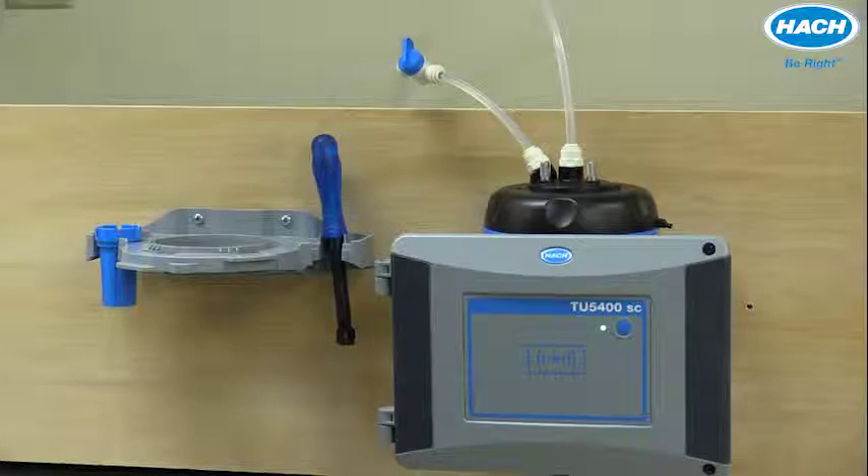Sample temperatures should be between 2 and 60 degrees Celsius. Maximum salt content should not exceed 3,000 microsiemens per centimeter. The maximum sample pressure depends upon the actual sample temperature — the higher the sample temperature, the lower the maximum pressure.